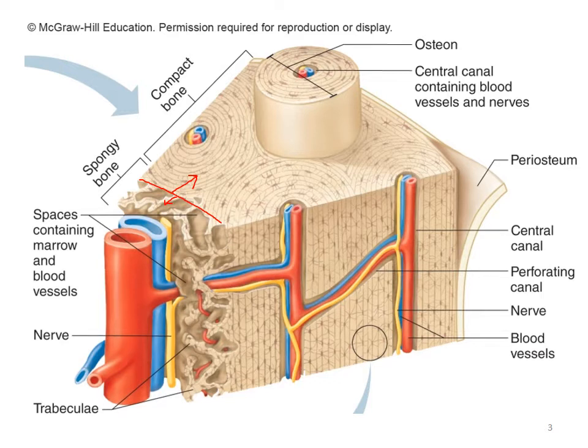Now on the spongy bone, there's not a lot we're going to point out, but I just want to show the trabeculae it's pointing at here. I know sometimes it's hard to envision it. It's just, again, in spongy bone, we have these little webs of bone, and they called it bone plates, but the name for those are trabeculae. And so that's where that comes from. So now most of this is going to be talking about the compact bone.